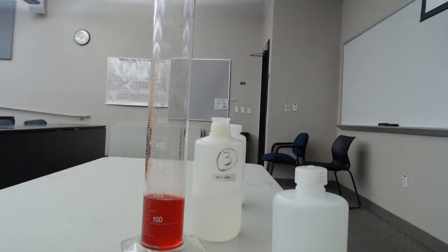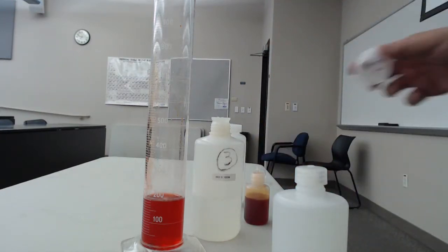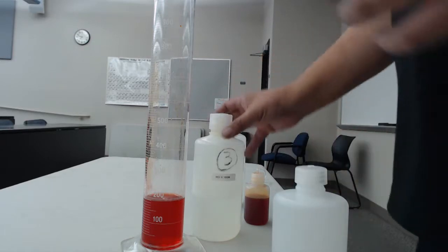This chemical itself is actually not very dangerous. It's hydrochloric acid, it's pretty dilute, it's only at 0.1 molar. One of the things that I try to help out with in lab is learning when chemical phobia is good and when it's bad, so I like for you guys to have an idea of what you're working with.